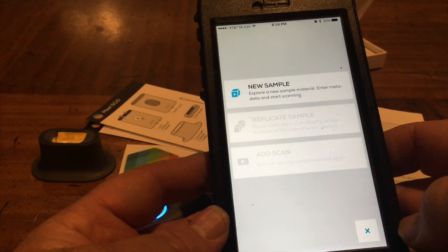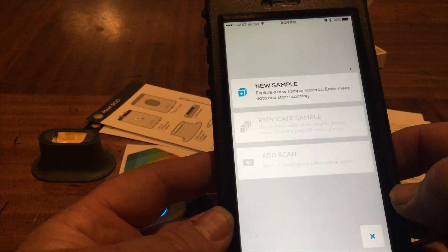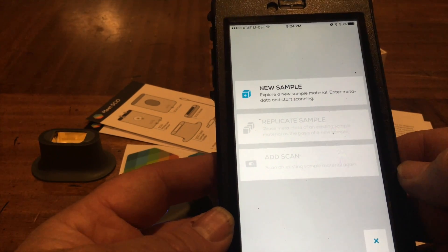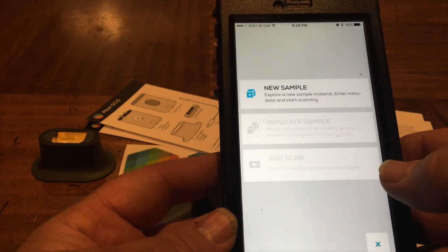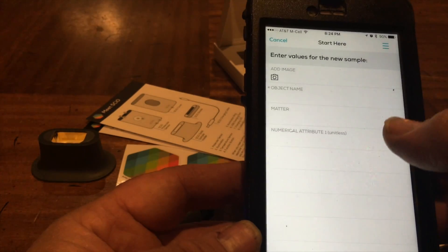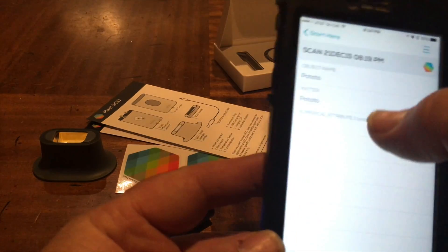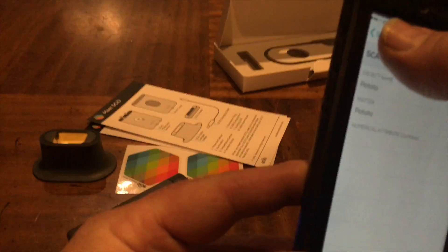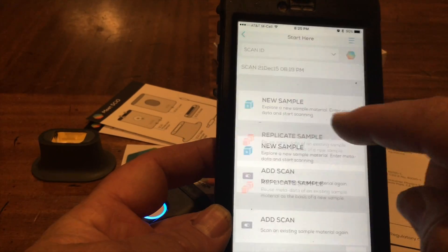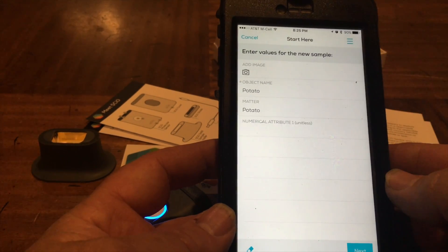New sample, replicate sample. So we can get another potato and scan that other potato, or scan to an existing sample. What if I didn't want to do any sample? Now it's all available, so I can replicate. Test object name, numbers - Sample 2.